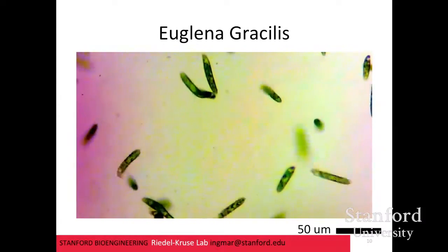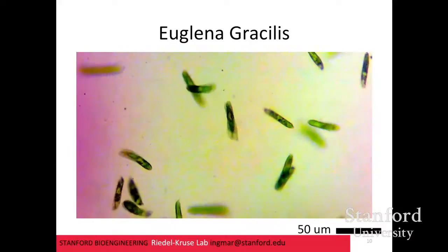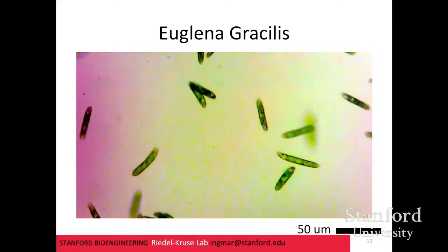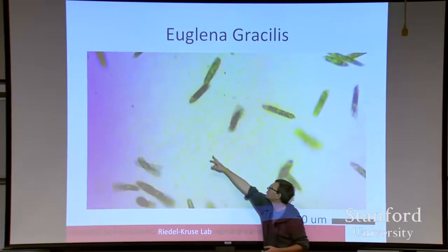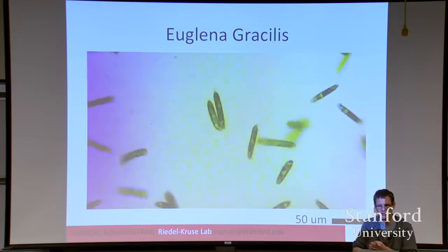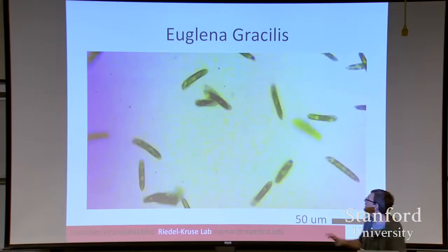So here you see these cells in action, right? If you follow more closely, you see their swirling motion. You may see that they actually roll around their own axis, right? You may also see, if you follow some of these particles here, these are passive particles that undergo Brownian motion, but at the same time, the fluid field moves around.